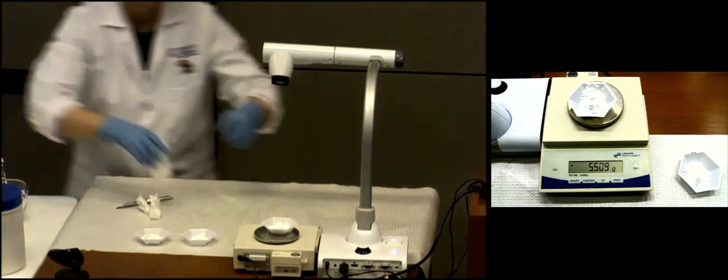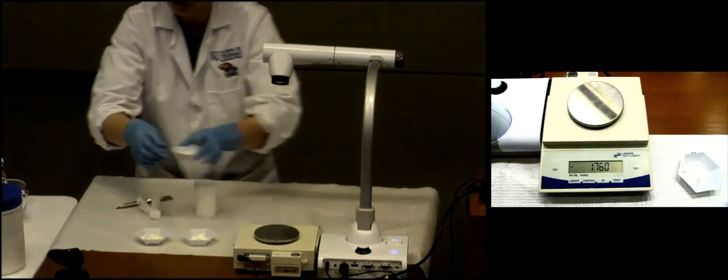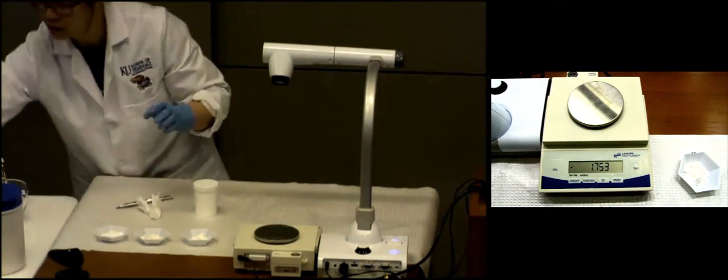One more of the absorbent powders to go. Okay, one more, and the last one is zinc oxide.